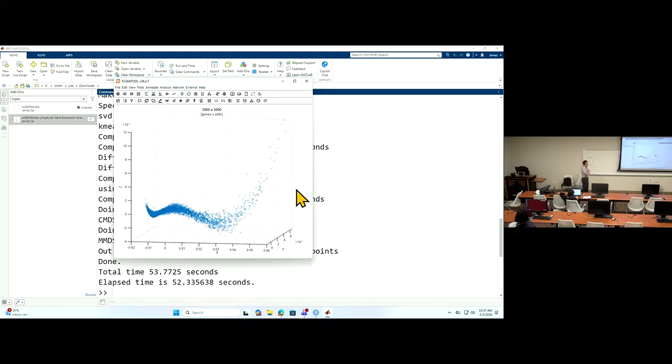It's hard to explain, but this is an ability of FATE that we can utilize. It could be no structure, but still there are very small step differences. When you apply it to real data, where real structure is there, or the pseudotime or development stage in the real data, maybe FATE is sensitive enough to capture this. That's what we hoped.